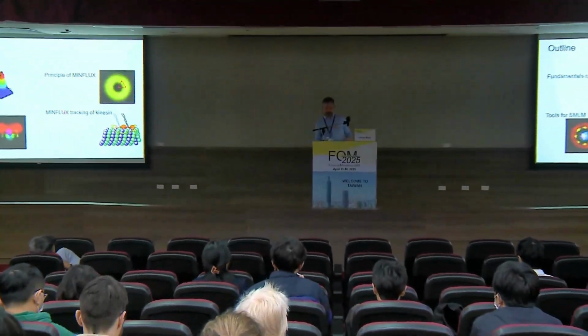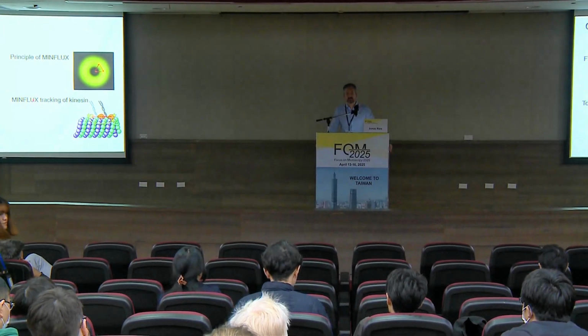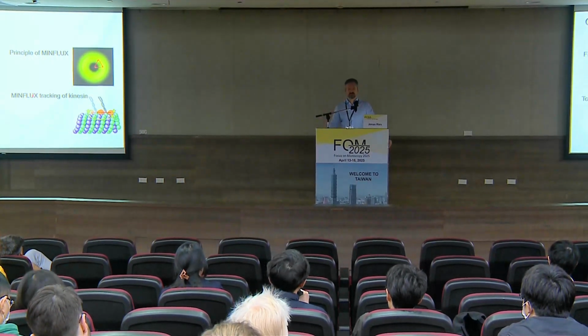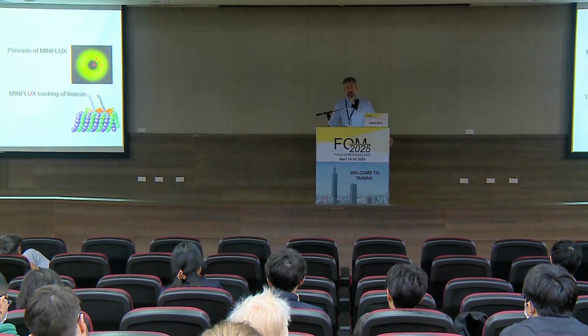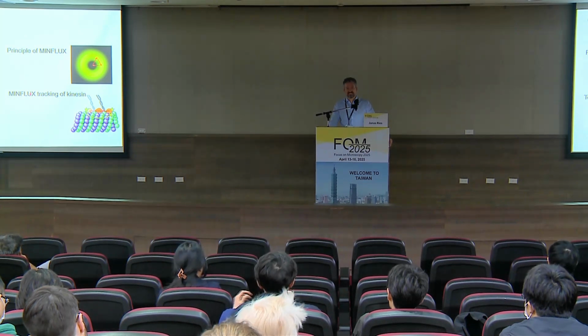Thank you for the nice talk. I'm sorry if I missed that, but you showed the fluorophore flickering makes the precision very much worse in MINFLUX. But if we already know the property of flickering, like 1 millisecond or what percentage, can't we improve the MINFLUX precision as you showed?